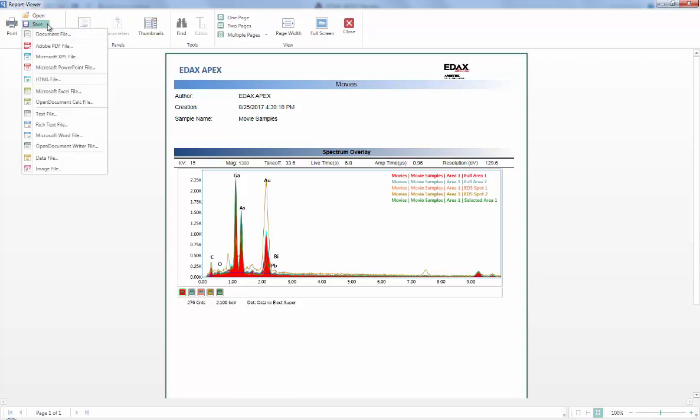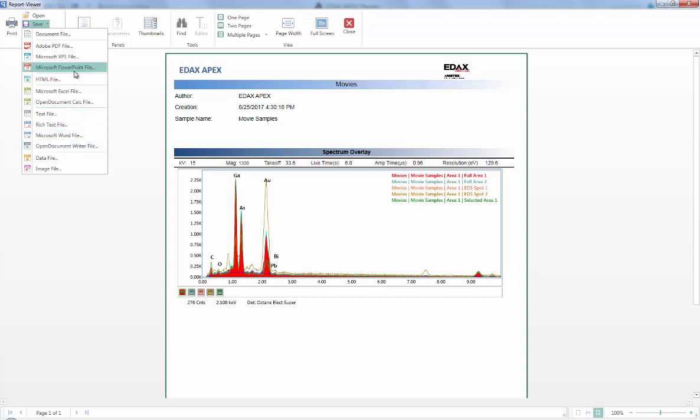Now one of those could be the save options. You can pretty much save this in any way you want, including Adobe PDF and PowerPoint, or the different word formats. I can often find the PowerPoint to be the best because then I have the objects as full objects. I can move them around, I can push them around, I can copy-paste them very much easier than from a PDF.